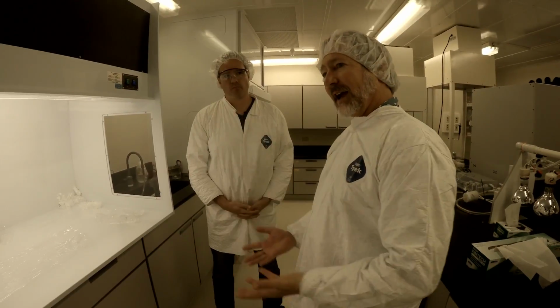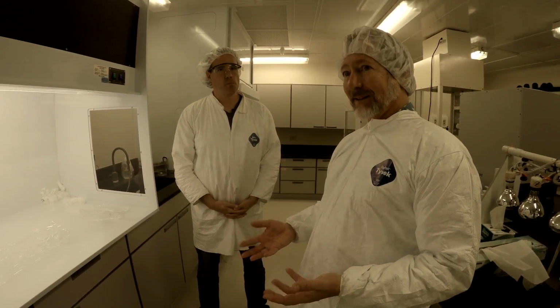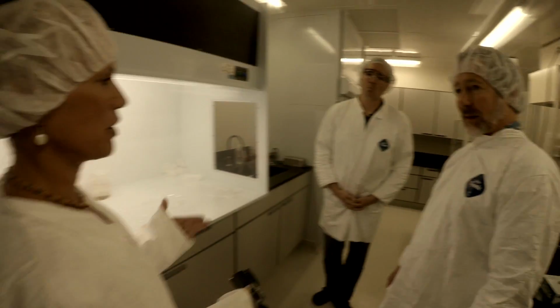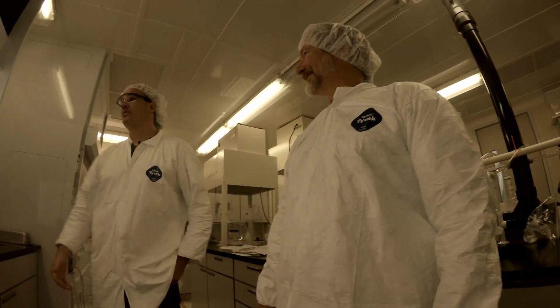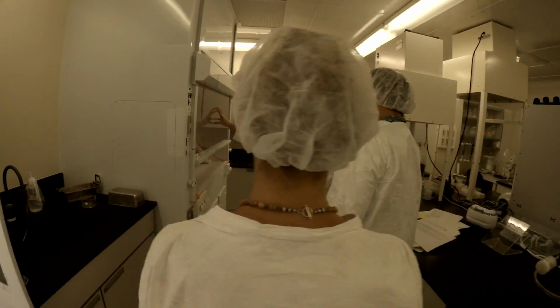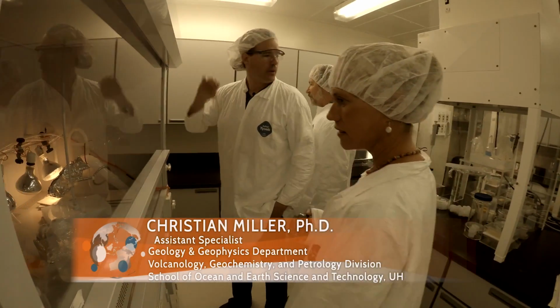So we would do all of our chemistry with ultra-pure chemicals in hoods like this that have filtered air continuously supplied, that are really, really clean. They're mercury-free. And in your case, it's not because the mercury would hurt you, it's because the mercury from the environment would contaminate your samples. Exactly. So we have a series of these hoods. This one is also a clean hood, but it also exhausts, and you can hear the fan going.